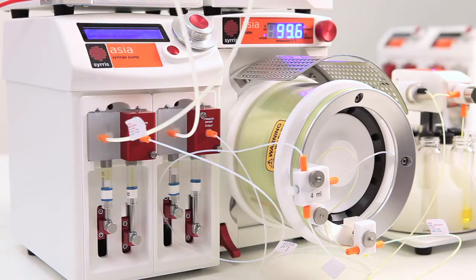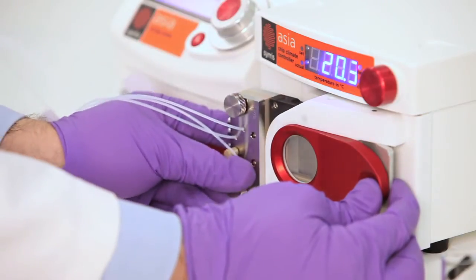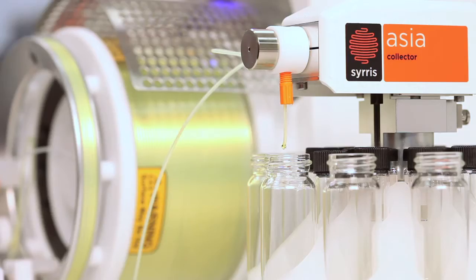This type of optimization can be run on a milligram scale in a micro reactor, then scaled up to a kilogram scale using a tube reactor.